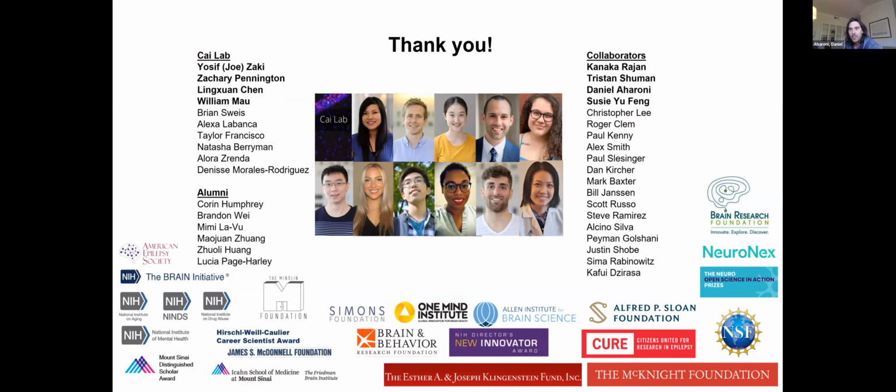Cool. Andrew has a question. I think most of the data shown throughout the entire workshop is just the standard GCaMP6f or something, or maybe newer versions. But would you expect that if you start to use somatically localized GCaMPs, it would significantly improve the output of these processing pipelines?